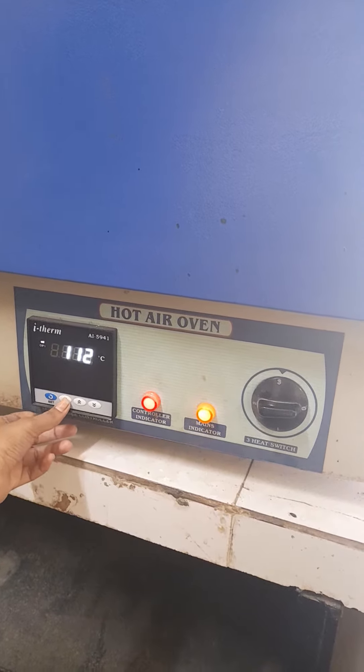There are three buttons: the first one is the controller indicator which controls the temperature, then the main indicator, and a third button.